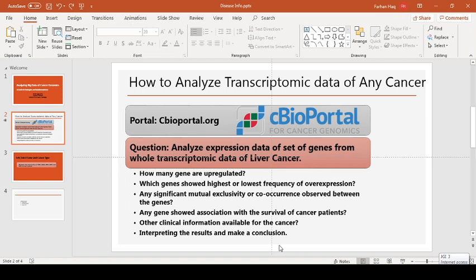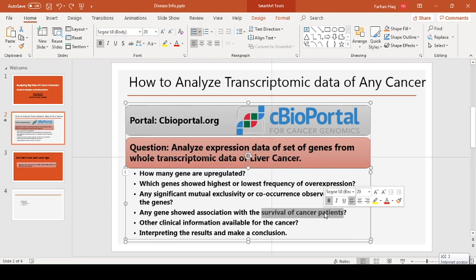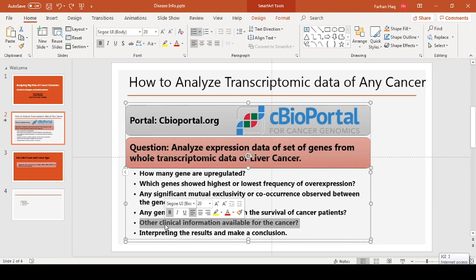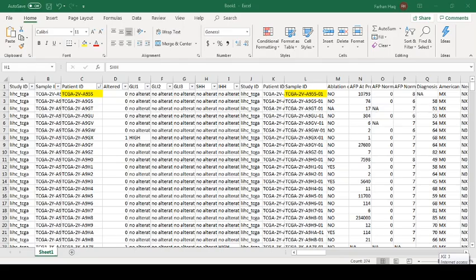So what can be the conclusion of our study here? The highest expressed gene was probably Gli3 or SHH — whichever showed 6 percent expression. So we can say that the overall expression is not very high — only 5 to 6 percent maximum expression for any specific gene — and there was no association with the survival of the patient. However, there might be some association between the expression of Gli1 and Gli3 because they showed co-occurrence, so maybe these two genes are acting together in the Gli1 and Gli3 pathway to perform a specific function. However, that is not very clear from the survival analysis in terms of what clinical implications these genes are making. If you want to dig deeper, you can analyze the clinical association using different clinical features.